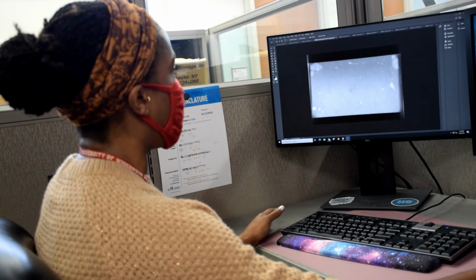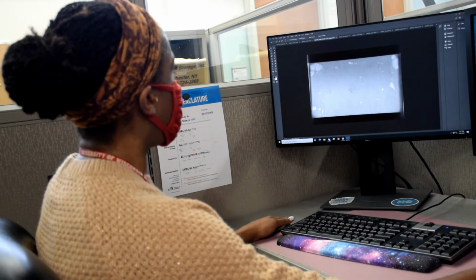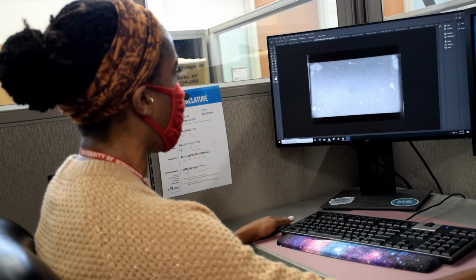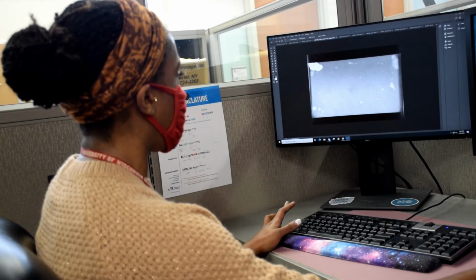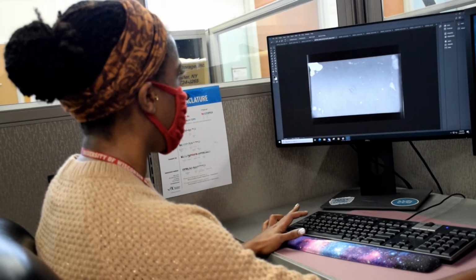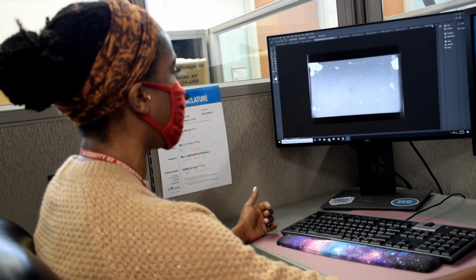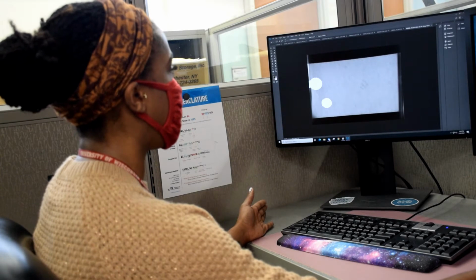Now in this case, we also want to keep all the spots together in terms of circling them. So now we select this little selection tool and make sure that it is on a circle loop. And we simply click on the spot and draw a little circle around the entire spot. And then from here, we're just going to crop it out. And we do this throughout the entire image. We continue on with this process until we have selected all of them. In this case it is a little bit simpler. We only had 2 urine spots, so we only had to select 2.